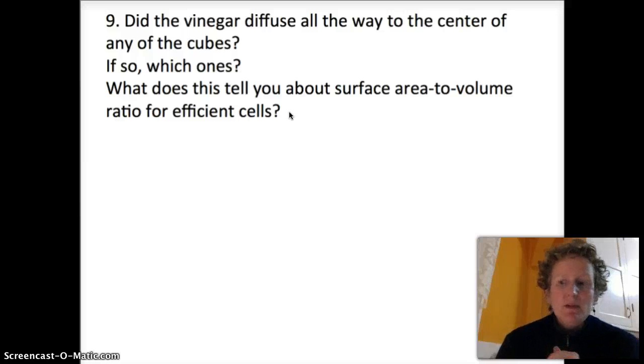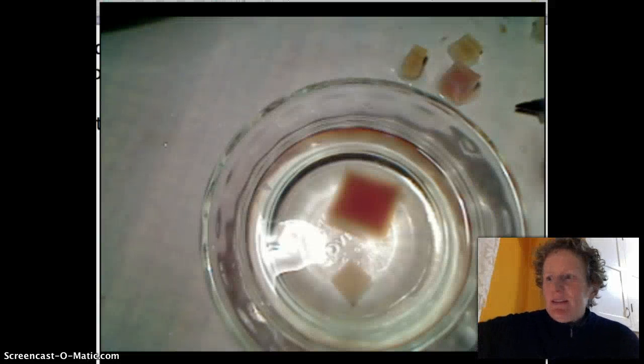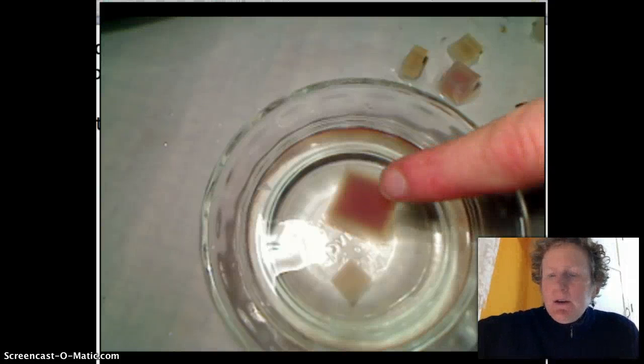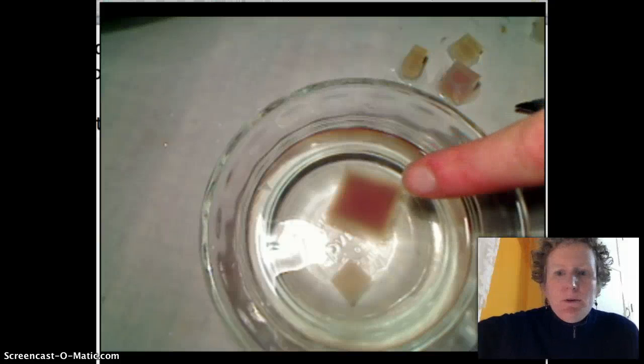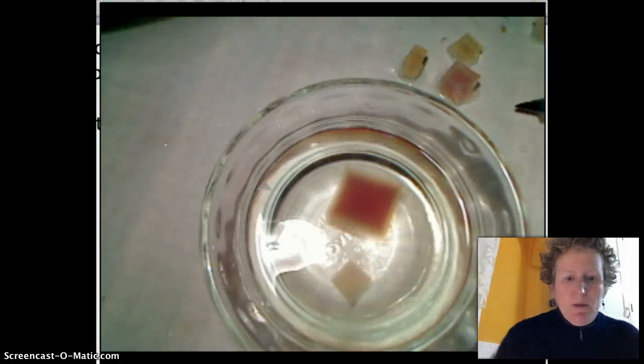So that one liter cell is too big for diffusion to work as passive transport across its membrane. Our little tiny cell will see that the vinegar diffuses all the way through that. It's pretty easy to see in the cubes the vinegar isn't even going to diffuse all the way through the two centimeter cube and it's already all the way through the one centimeter cube.